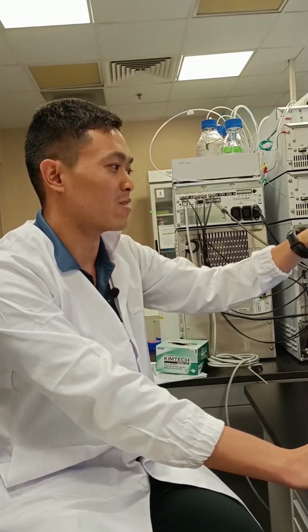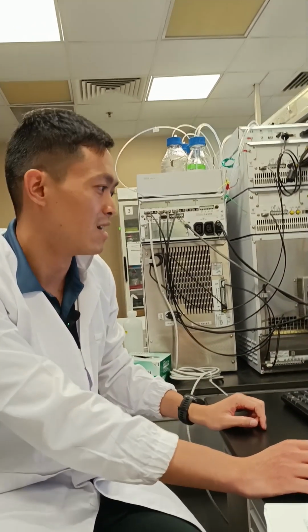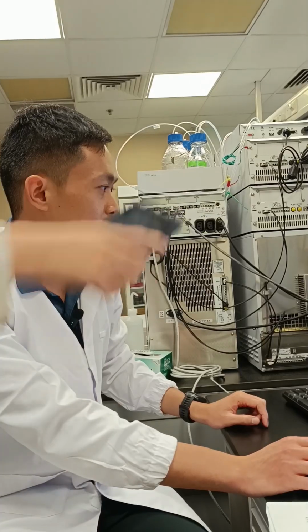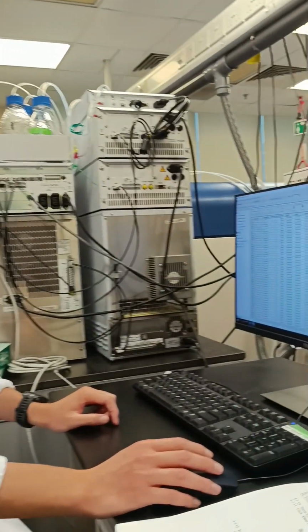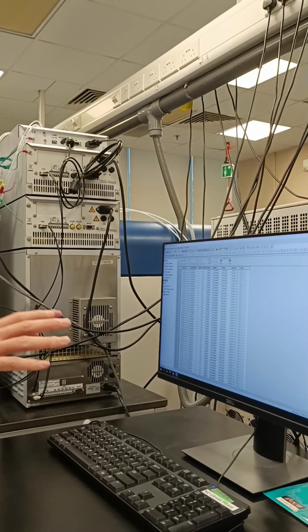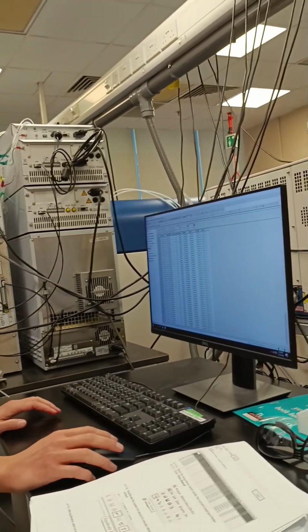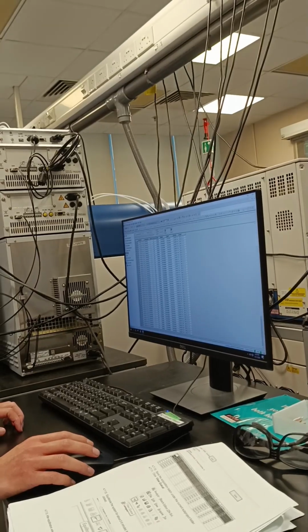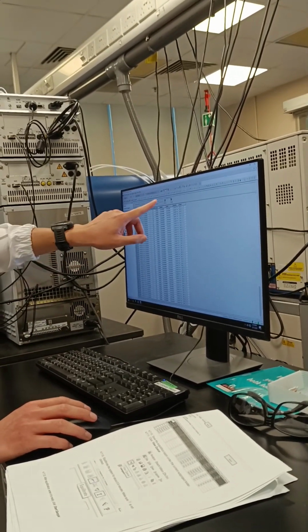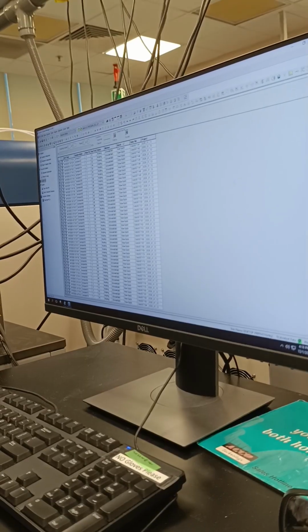It was still stuck on the first stage, which means something was wrong with the needle or something. So you wait for it to change. I'll wait until it starts running, I mean the experiment is starting accordingly, then I'll leave the lab. You can see here it will show you the number later. If not, then something is wrong with the machine.